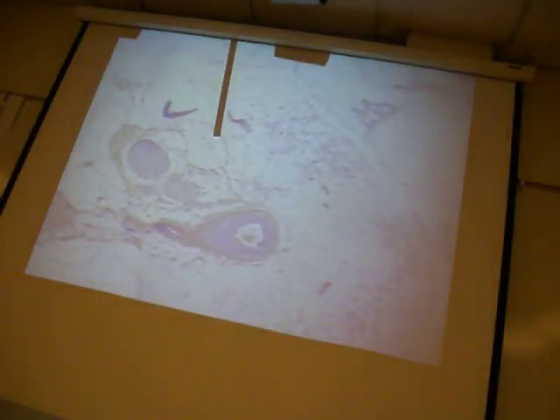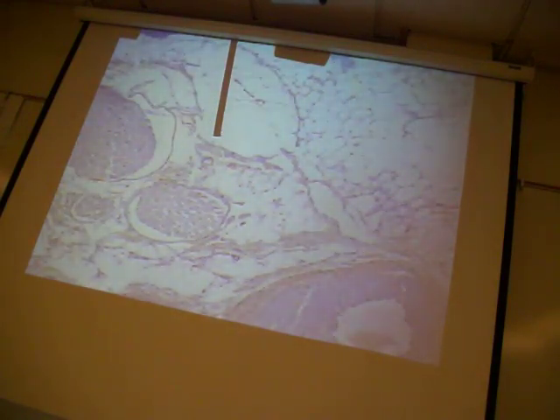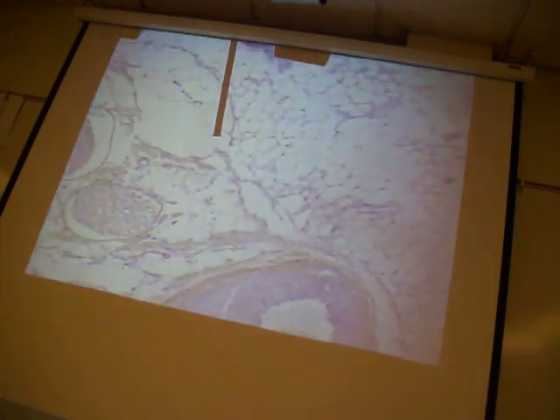The other thing I want to show you guys, we'll look for on here, is a blood vessel. Now I'll show you generally where. I know a lot of you guys have already had anatomy, correct? Yeah. And so this portion of the lab should be much easier for a whole bunch of you. For some of you guys, it's going to be the very first time you've seen any of this stuff. Now, when you pull a slide, the slide is going to have a name on there. What that means is that the tissue you're looking at is on there.